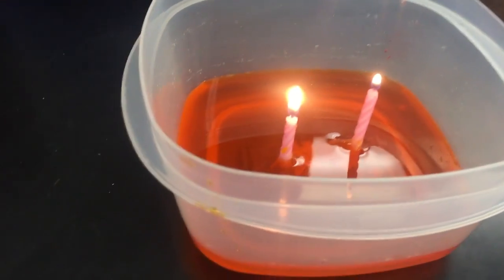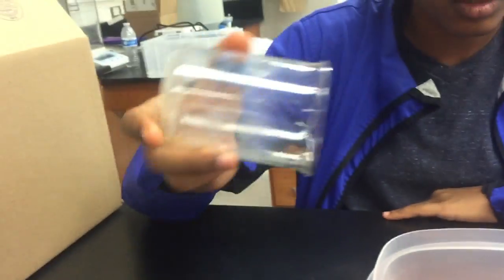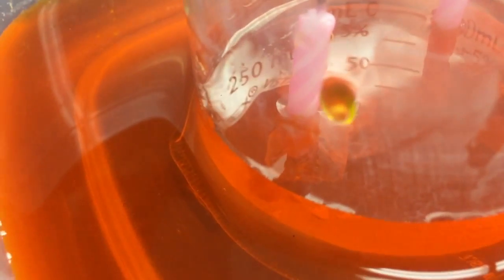Okay, so now that both candles are lit, we're going to cover the candles with the beaker to make sure that they don't touch the sides of the beaker, and making sure that the bottom is once again fully submerged. One candle already went out, and the second candle also went out. And as you can see, the level of the water is much higher than it was with one candle.